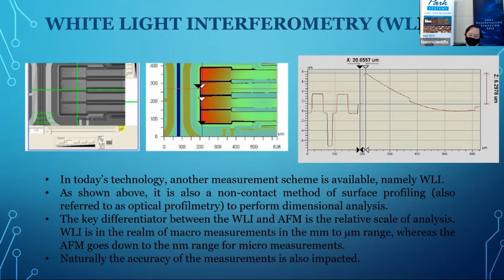So the white light interferometer has its benefits, particularly in this instance where we're talking about MEMS structures. These are structures that are released on the surface so that they are not flat, but are protruding up in mid-air. So the question is, why would we use an AFM if I already have a white light interferometer? It's also three-dimensional. It is able to quantify height. In fact, it can even quantify scratches and roughness.